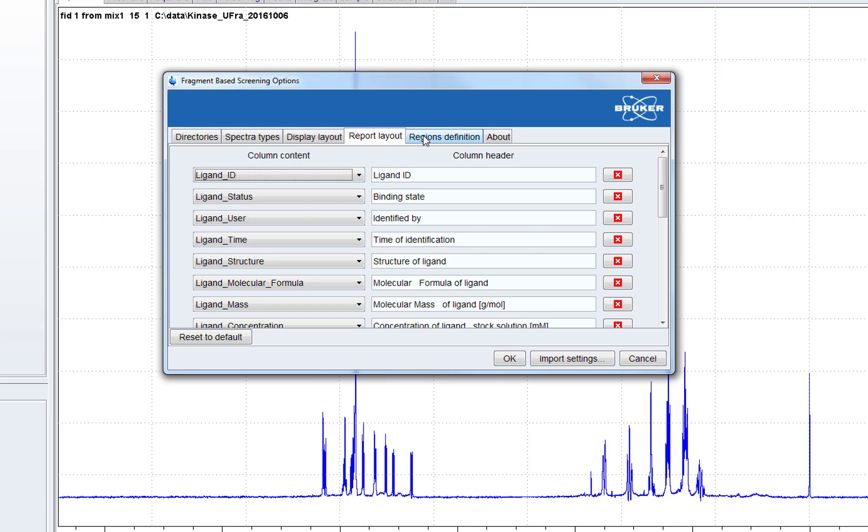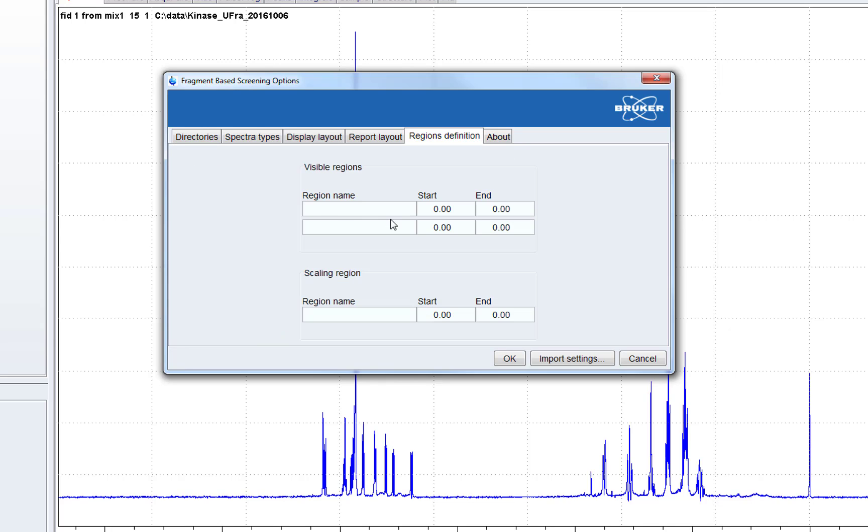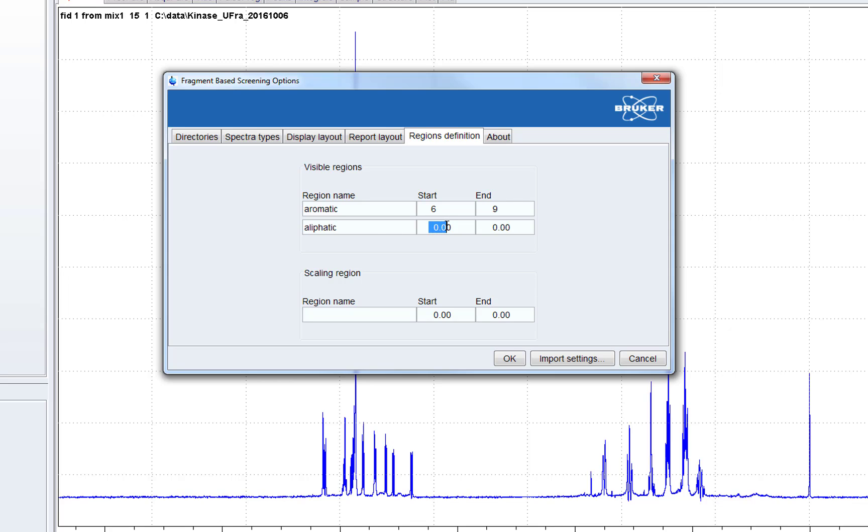This is the report layout. And here we can choose display regions. This is also optional. Usually an aromatic and an aliphatic region is chosen and we can choose the boundaries of these regions and we have shortcuts in the display that allow us to jump between these regions.